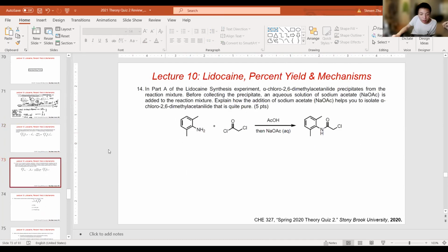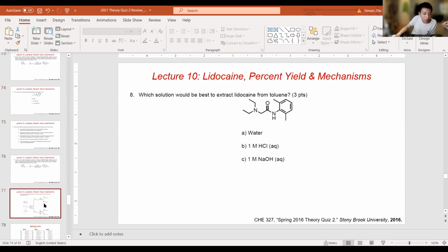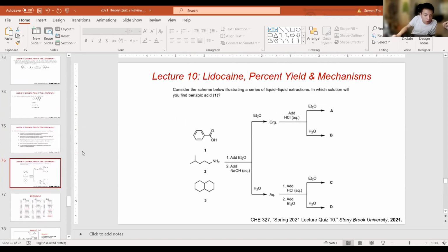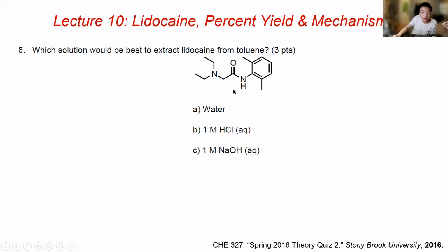And this question asked, why do we use NaOAc? Because we want to make sure that the side products are soluble in water. And the extraction theory. Extraction for the lidocaine is kind of complicated.